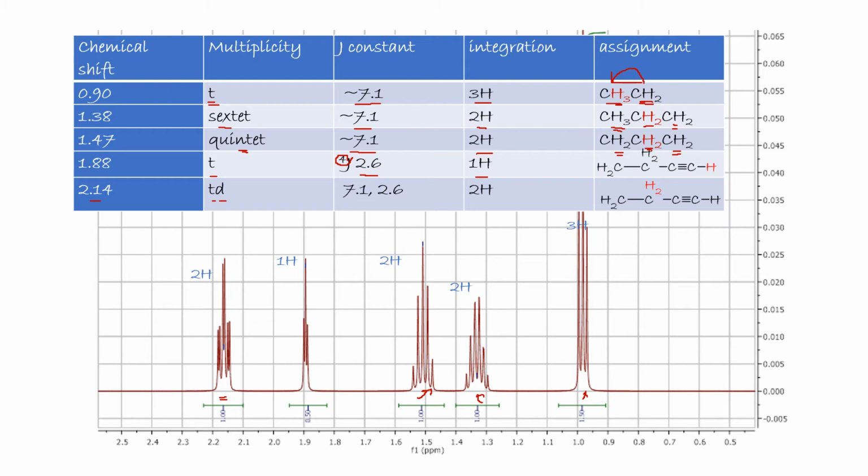So if this is the case, the terminal proton shows up as a triplet through the triple bond, as we have coupling between this CH2 and this hydrogen, J4. That's assumption 1. Here now we have CH2 adjacent to CH2, it will show up as a triplet, and with this one will be a triplet of doublets. Well, sounds good.